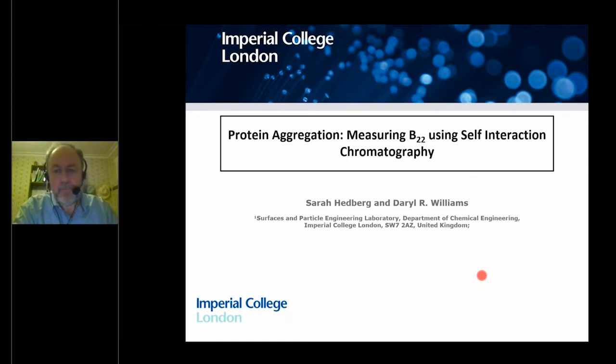Any other IGC questions, Ramiz? Yes, one more. Is this applicable for layered materials? The only constraint is, can you pack the material into a column? If you can pack your sample in a column, potentially we can do IGC. So we've done fibers, we've done films, we've done granules, I've done pellets. If I can pack them in a column, I can do IGC. That's the only constraint. From time to time, we get samples that are like thin films or even thick films, and there are accessories you can buy that allow you to study larger film or larger monolithic samples as well. So even that can be done.